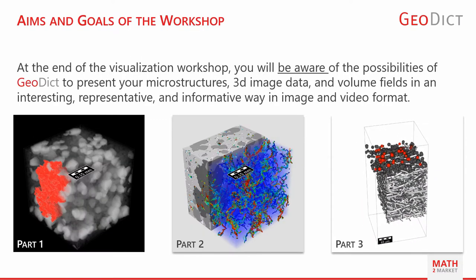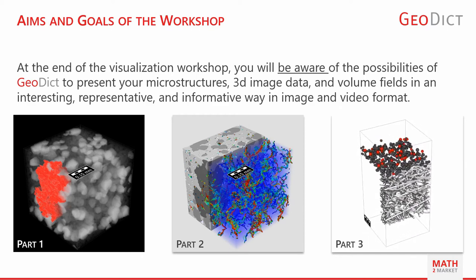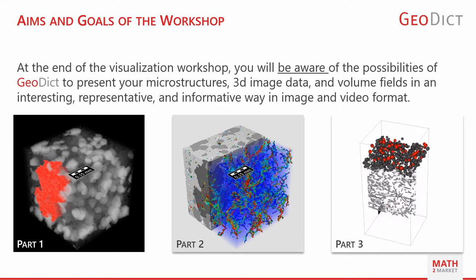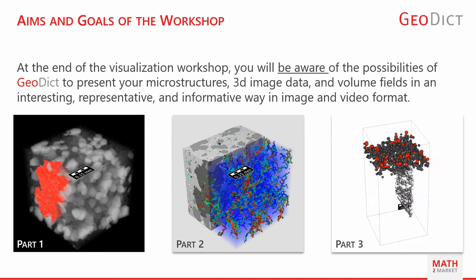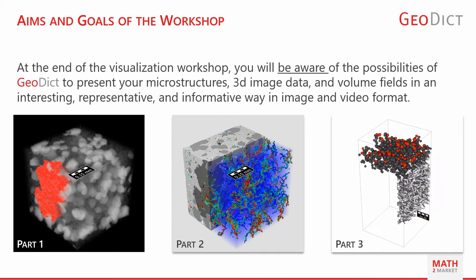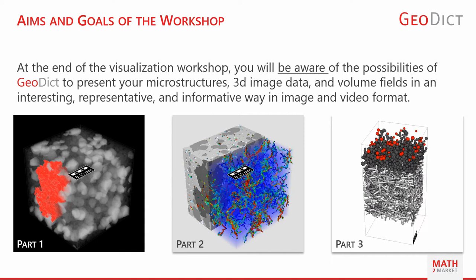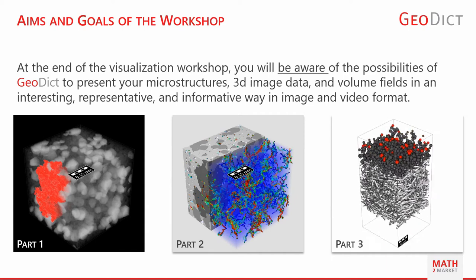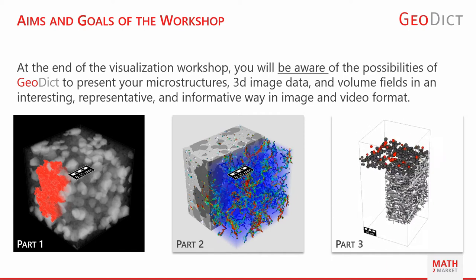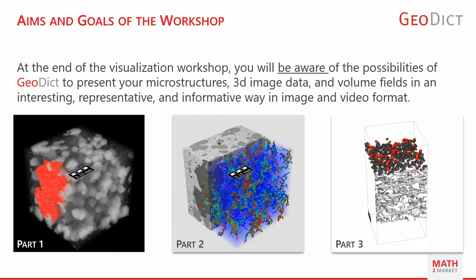This workshop is divided into three parts. In part one, we will look at how we can visualize 3D image data and the associated segmented and voxelized microstructures in an informative and appealing way. We will make sure to find a good compromise between descriptiveness and an attractive visualization. We will then save our results as image files.